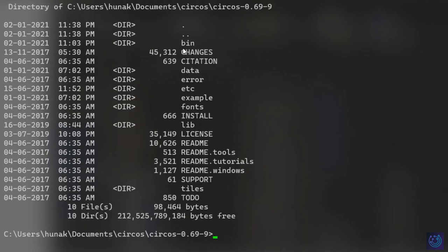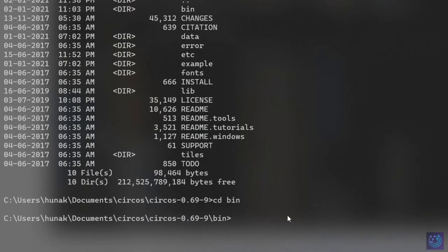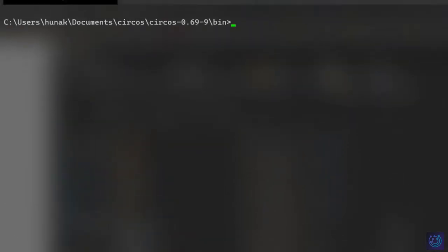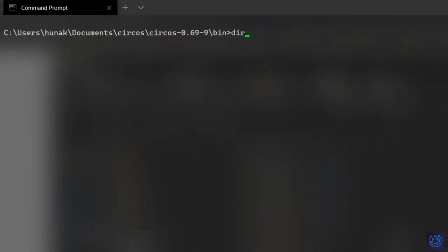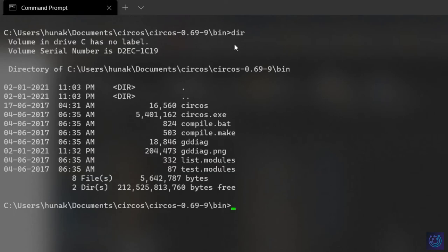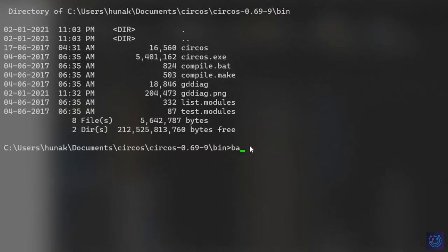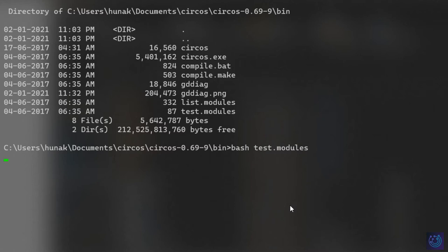To proceed further, let's enter the bin folder by typing CD bin and hit enter. After this, let's clear the console and find out what's in this directory. The first thing we'll have to run is the test modules file. This is a bash file, so type in bash space test and tab to autocomplete, or you can type it manually, and hit enter.